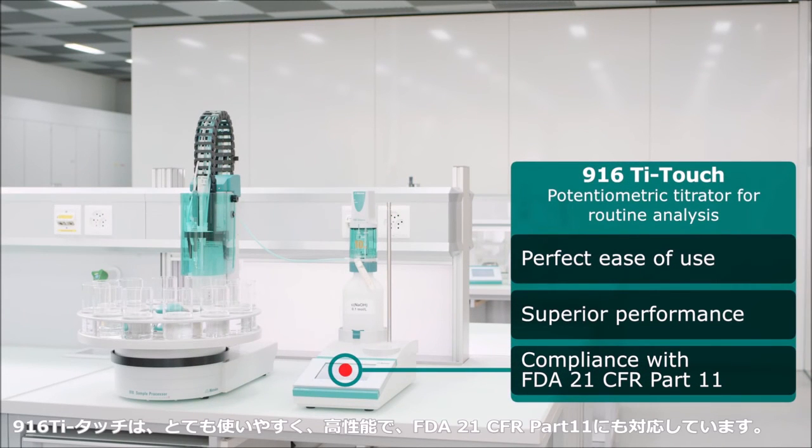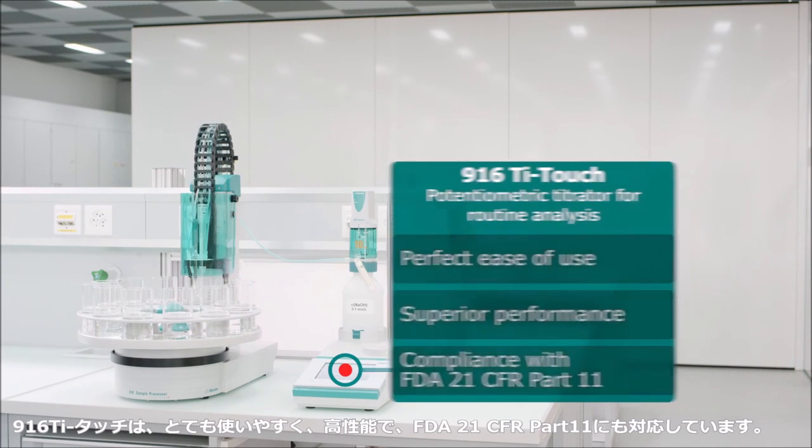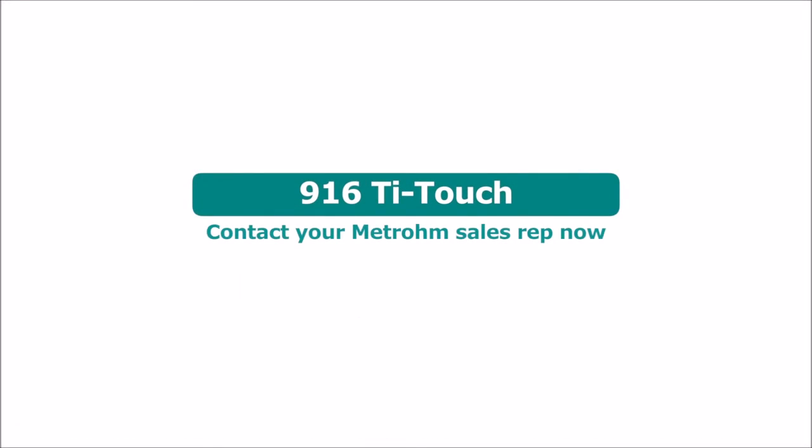The 916 T-Touch: perfect ease of use, superior performance, compliance with FDA 21 CFR Part 11. Contact your Metrohm sales rep now.